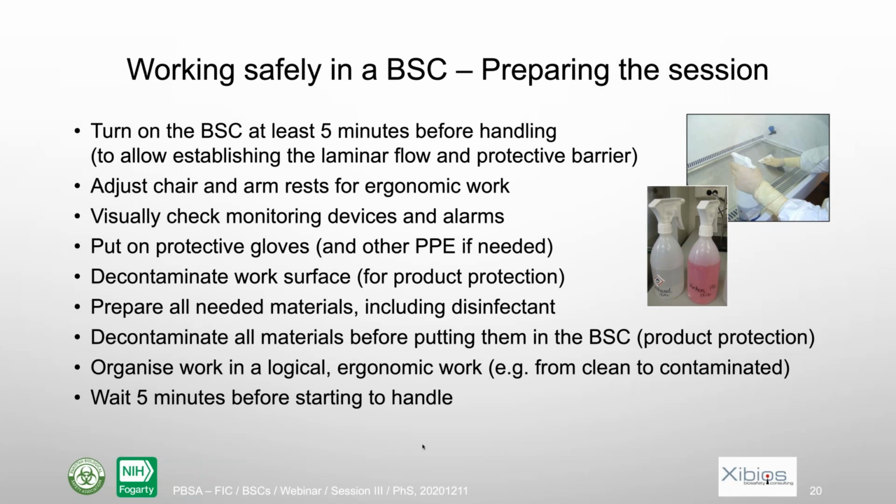And then, when you have put everything inside of the biosafety cabinet, then you still wait 5 more minutes before starting to handle. Why? Again, so that the air is cleaned up during that time, and also so that when you start working, the laminar flow is again laminar.